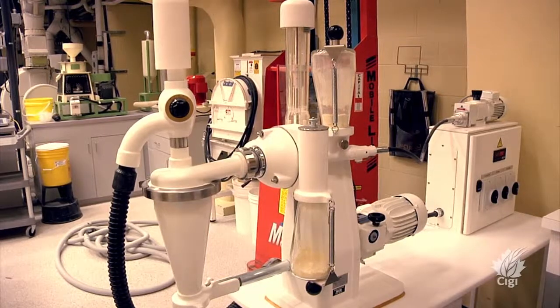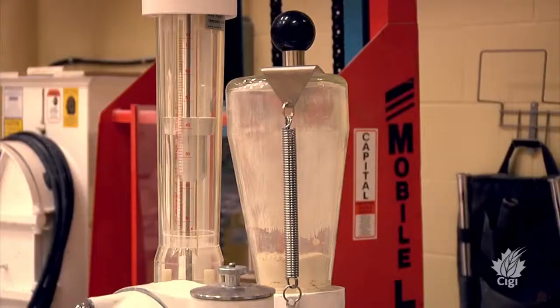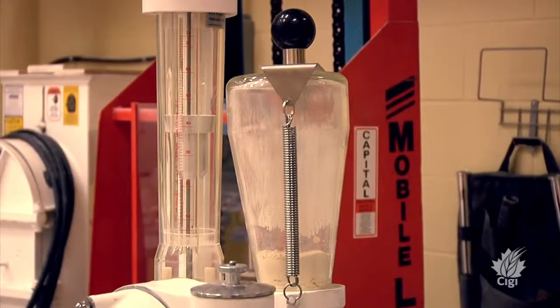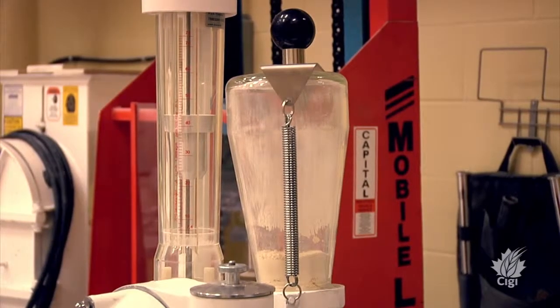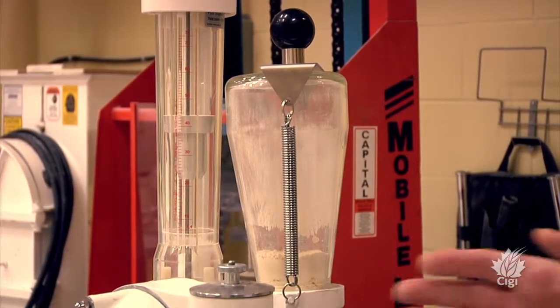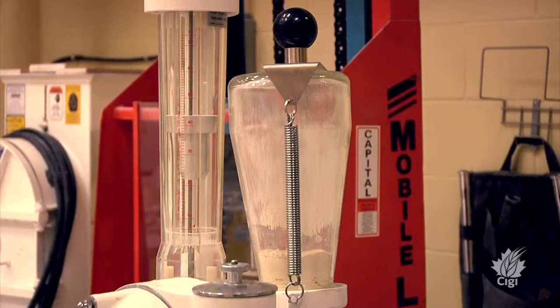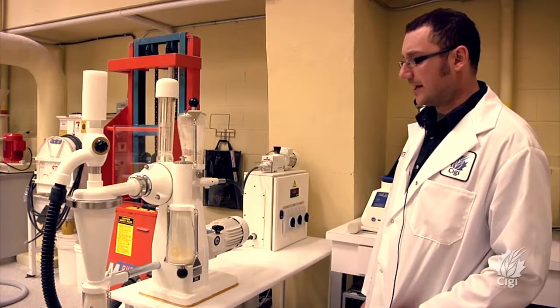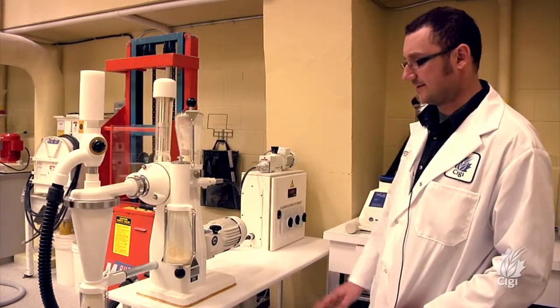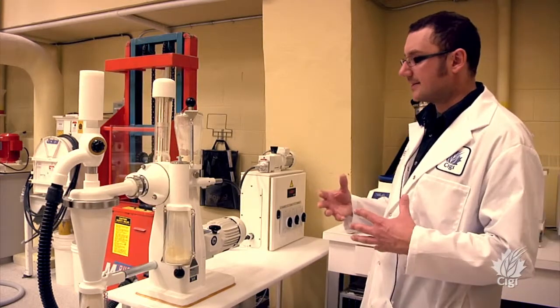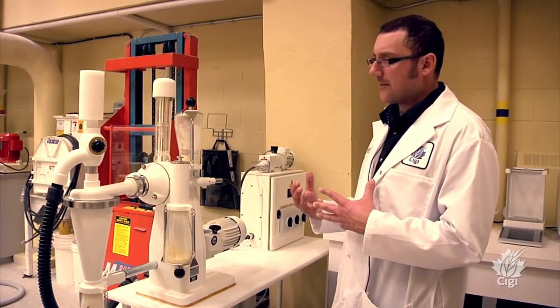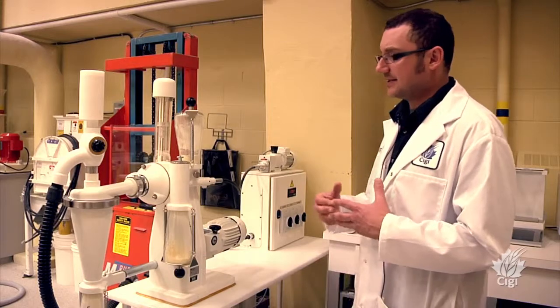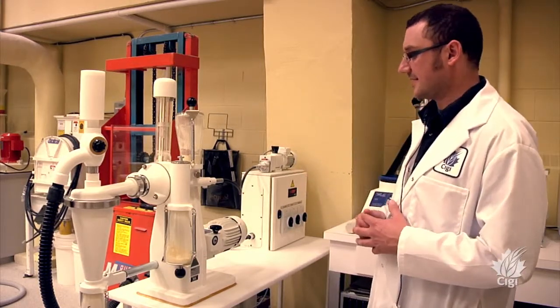So far to date at Sigi, we've done work with yellow pea flour and we're learning how it reacts when put into the system, and we also have done work with lentil flour as well. We'll be doing many more projects with different pulses and even looking at different pre-treatments prior to this process to see how efficient the process can be.